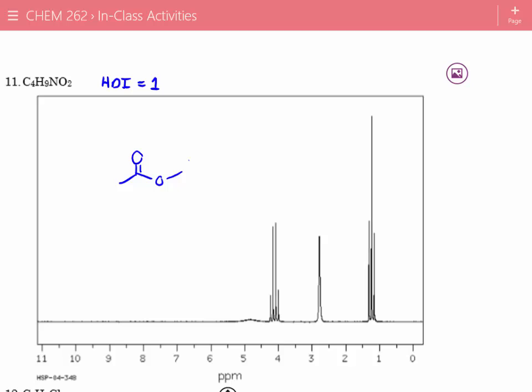But one thing I have noticed is that this peak at 4 probably corresponds to protons coming off of here, just like we've already seen. And then there's a triplet over here, which is probably these terminal methyl groups. So oftentimes when I look at NMRs, I look for triplets and quartets. Triplets and quartets oftentimes are a good hint that there's some sort of ethyl group there. So I'll label these HA, and then HB. We know that this is HA, this one's HB.